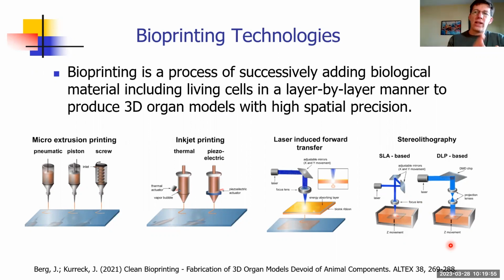So it always depends on what you really want. Do you want to be very cell-friendly? Do you want to have a high resolution? Do you want to include multiple materials? Do you want to have a single material only? So each of these applications needs a different bioprinter.